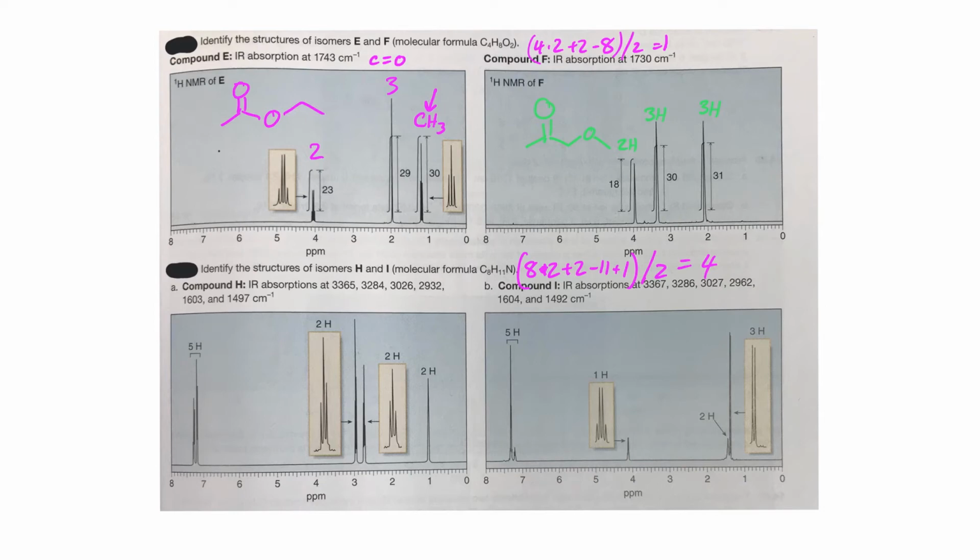The other indication is observing that we have IR absorptions just above 3,000, 3026. That is a very good indication that we have some hydrogens attached to sp2 hybridized carbons. We also see some aliphatic hydrogens, which are hydrogens attached to sp3 type carbons. That's pretty standard. And then we have these peaks down here. They may have something to do with the nitrogen. Remember that NH absorbances on the IR oftentimes occur in the same region as OH absorbances. So these could have come from the NH absorbances.